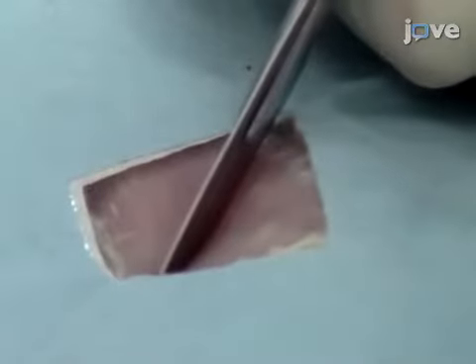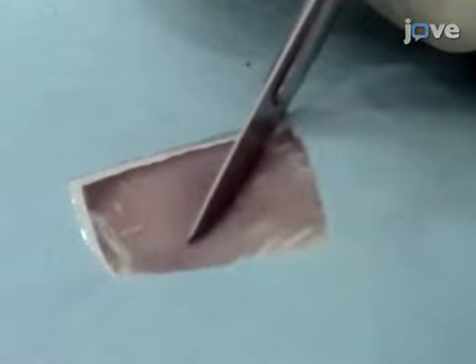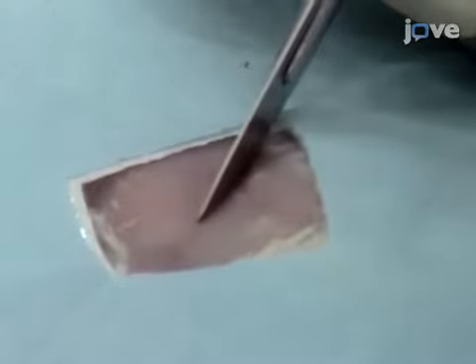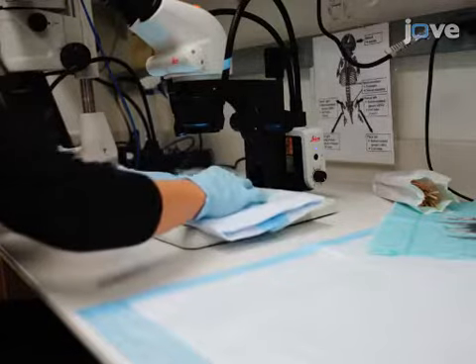Next, cover all of the mouse with a sterile drape. Then, use a sterile number 10 carbon steel scalpel blade in a number 3 handle to make a 1 to 1.2 centimeter skin incision between the fourth and fifth nipples in the lower right abdomen, and transfer the animal under a standard benchtop dissection microscope. Under the 4X objective, insert blunt separation forceps into the incision between the fatty tissue and the peritoneum and push the tissues outwards on both sides to reveal the iliac vessels and nerves.